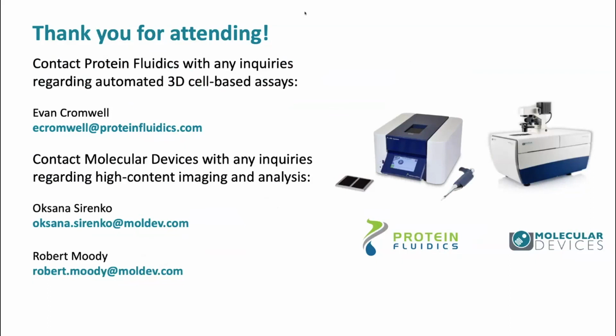So imaging is typically done for one well at a time, and it depends on the time of imaging, acquisition, and speed of analysis. Typically we image each well in about a second, depending on how many wavelengths you're using and what the exposure time is. So it goes pretty fast.